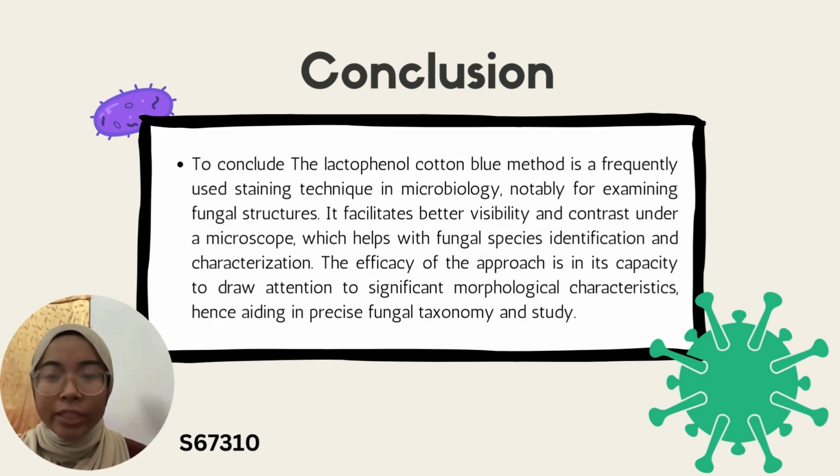For the conclusion, the lactophenol cotton blue method is a frequently used staining technique in microbiology, notably for examining fungal structure. It facilitates better visibility and contrast under a microscope, which helps with fungal species identification and characterization. The efficacy of the approach is in its capacity to draw attention to significant morphological characteristics, hence aiding fungal taxonomy and studies. Thank you.